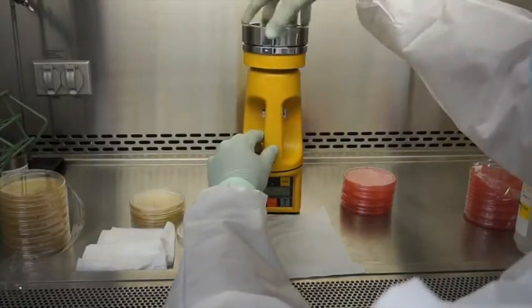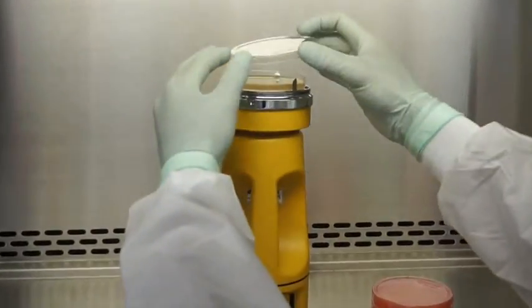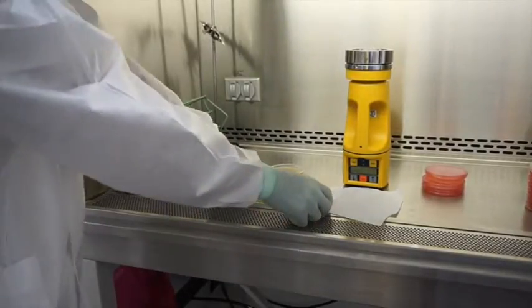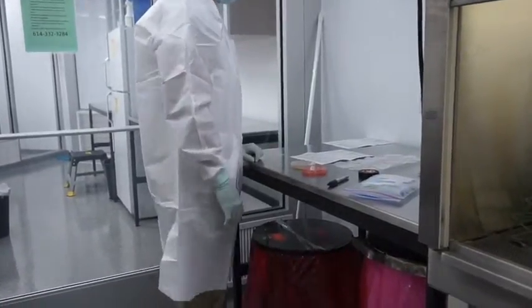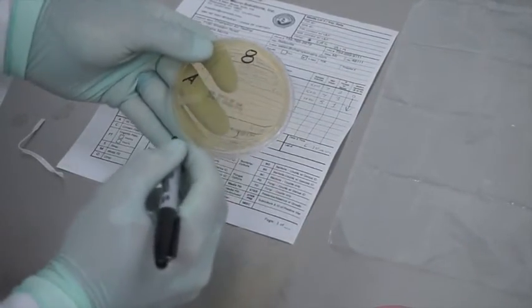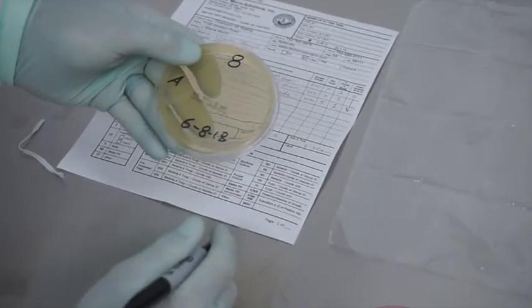When unloading the cartridge, go ahead and aseptically take off the head of the sampler, take your petri dish lid and carefully place it back on, and then take the plate out of the air sampler. Once you've completed the air sampling, make sure to aseptically take the plates over to your second staging area. This is where you're going to fill out the rest of your chain of custody and label the plates on the underside — we're numbering it, leaving the 'A' there for air sample, and dating it.